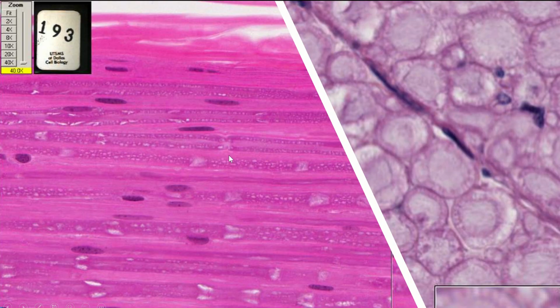Okay, and now we've got little zoomed in pictures of the axons and their myelin. Here you can see the innermost circle of this is the axon, and then you can see this little coat around it. That's going to be the myelin, right? So this is the axon in the center, the little coat around it, that's the myelin, right? So that's surrounding all of these axons to protect their signal and make things go faster.